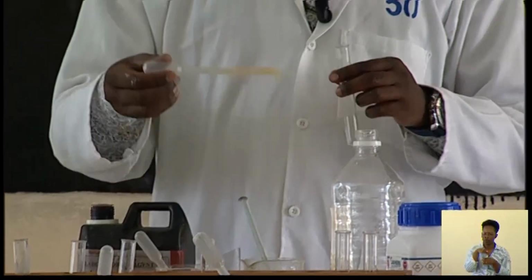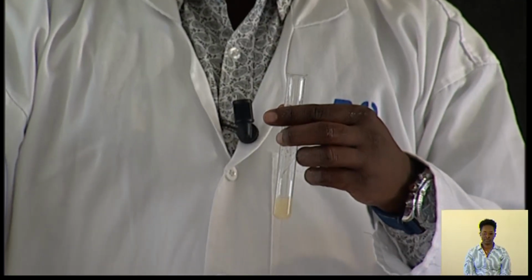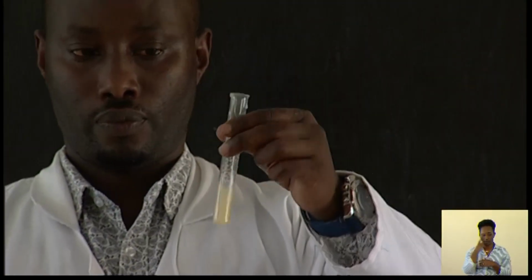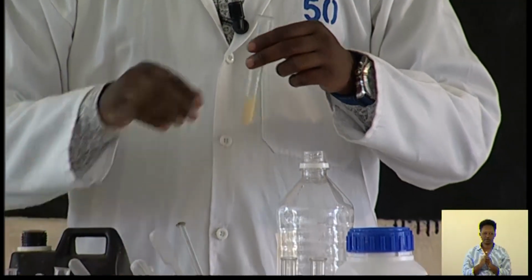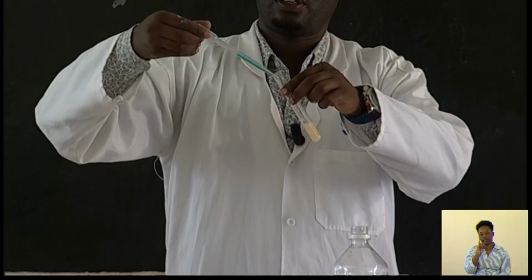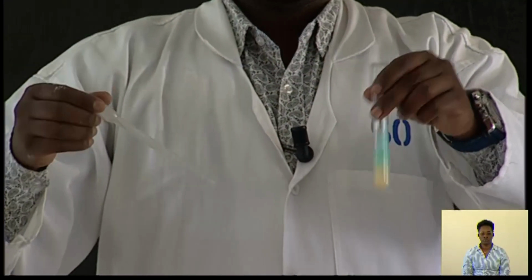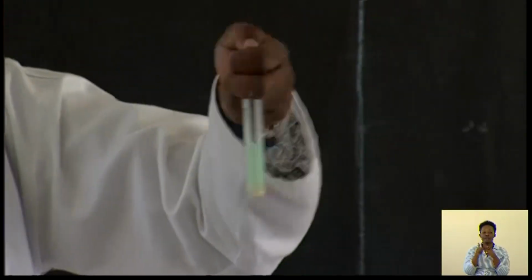I measure about 2 milliliters. I'm putting it in the sample. Then from there, you can see this is a sample of it. Then I have to add Benedict's solution. After adding Benedict's solution, you see the color of the Benedict's solution. You can see it is blue in color.